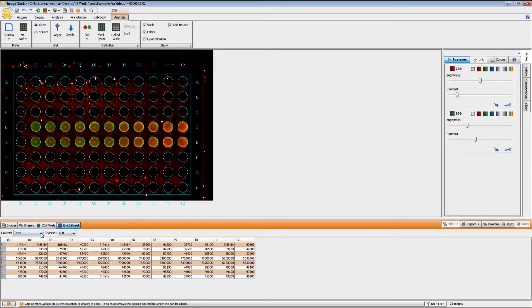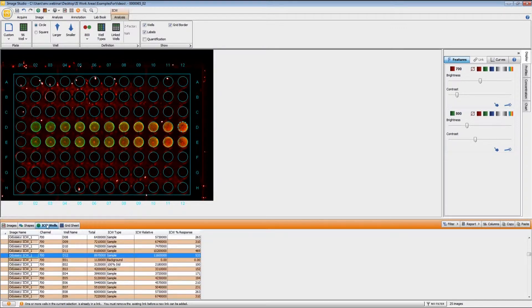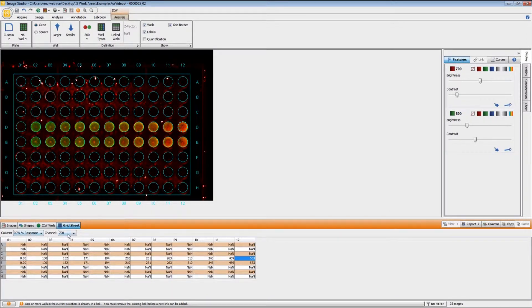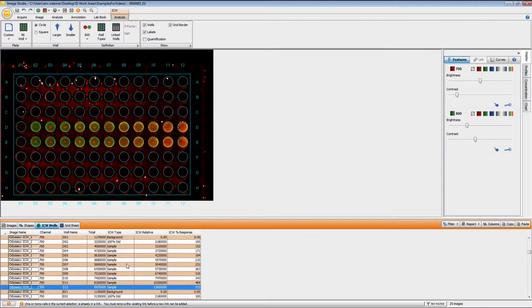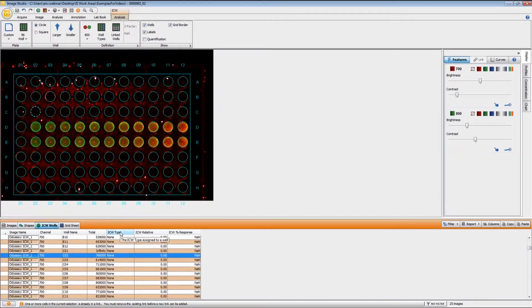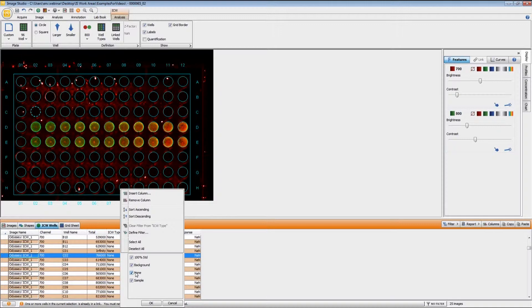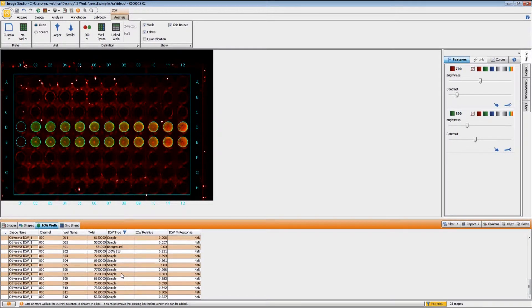Looking at the Grid Sheet, if I put in percent response for the 700 channel, we see the data plotted in grid format. So if you would like all data in a column format, use the ICW Wells table; if you'd like a single data point for a single channel, use the Grid Sheet. To simplify this table — since there are many empty wells — you can use the ICW Type column to filter out wells labeled as none. Right-click on the column header and uncheck none, and now only wells designated as background, sample, or 100% are shown.